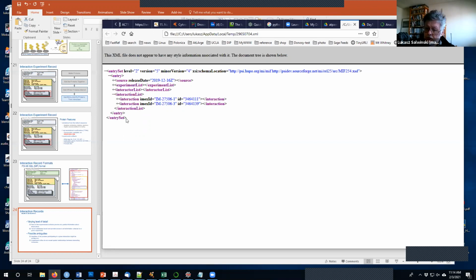It's useful to be able to process those files, because the format is very universal. The names of the elements and the meaning of different fields might be different, but the structure is common to many records.